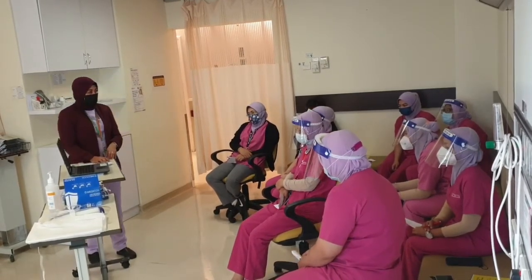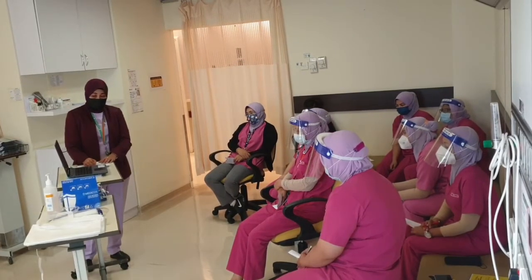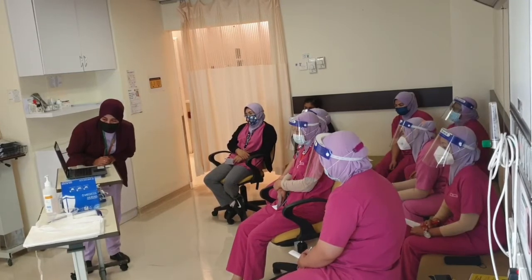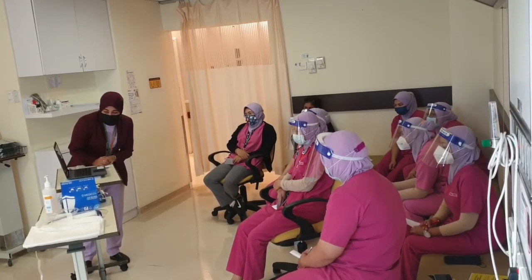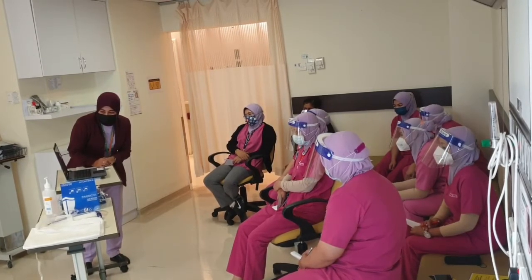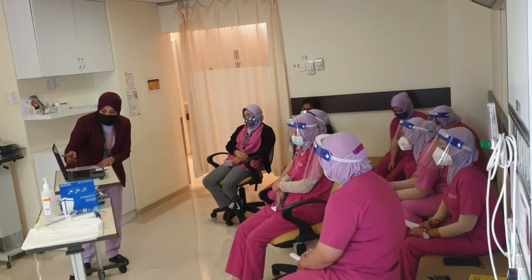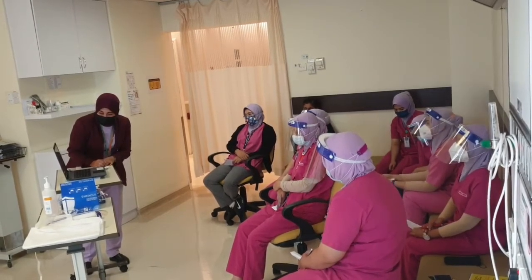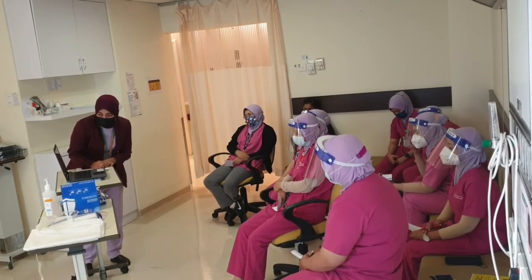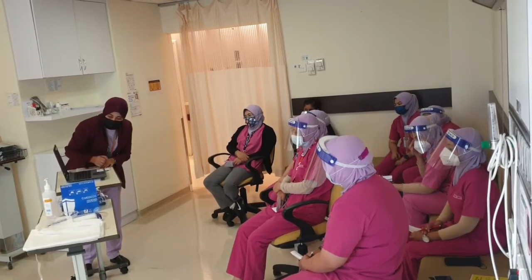This is a slide show of the proper removal of gloves. First, pinch and hold the outside of the glove near the wrist area. Peel downward away from the wrist, turning the glove inside out, and pull the glove away until it is removed from the hand, holding the inside-out glove with your gloved hand.